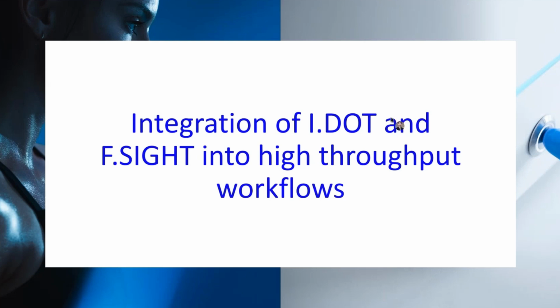Thank you, Holger, for the kind introduction, and thank you, Christoph, for showing us such a powerful technology, the PICO assay, and its application at the single-cell level. As you might have noticed by now, the common themes of this webinar are single cells, assay miniaturization, and high throughput. It was very interesting to see how the F.SIGHT and the I.DOT were used for sample preparation, enabling a high throughput, low volume single cell assay. I will continue with this theme. I would like to showcase some other examples of how the F.SIGHT and the I.DOT can be integrated in high throughput workflows for more precision, reproducibility, and usually at a lower cost per cell or well.